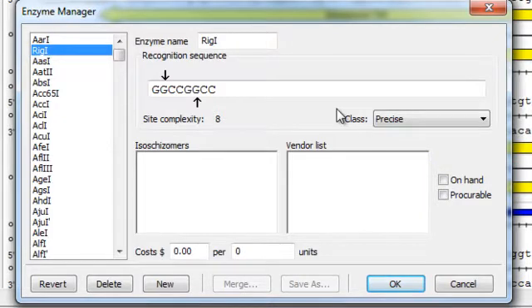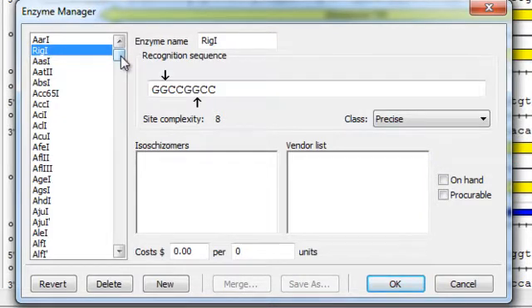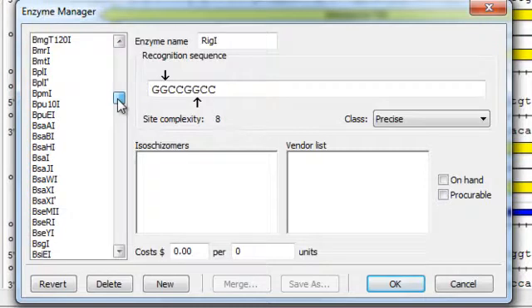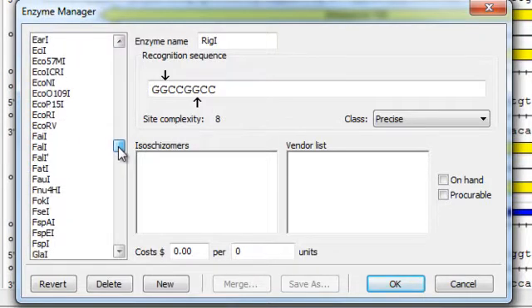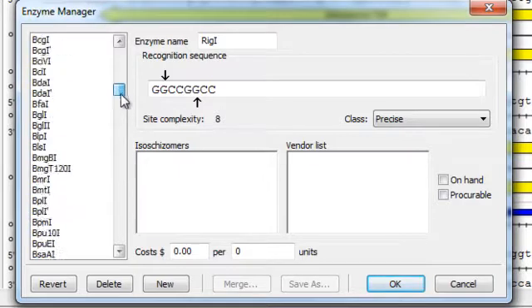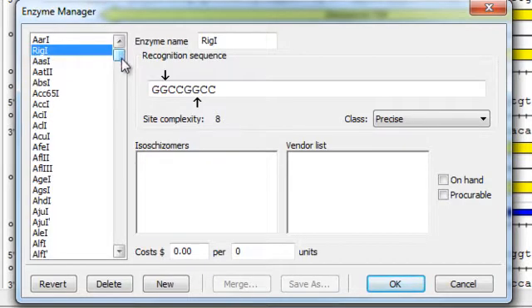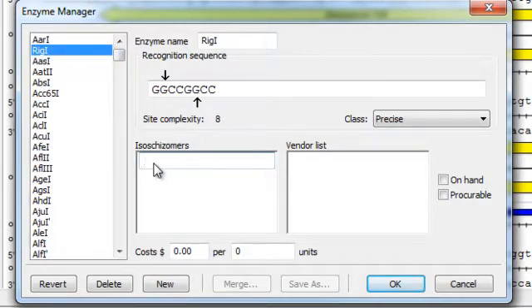Now, for this example, Rig1 is actually an isoschizomer of FseI, which you can see is already in the enzyme list. But just for the sake of this example, I'm going to add Rig1 as a new enzyme, and I'll specify FseI as an isoschizomer.